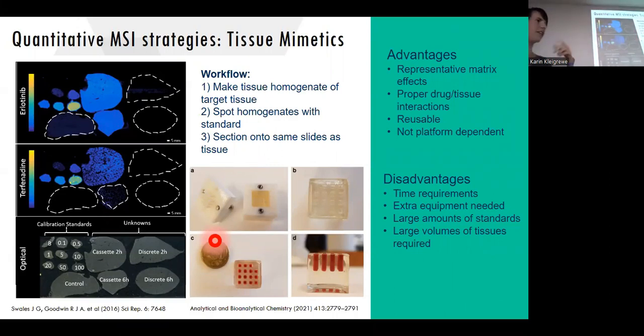And we've had that a lot in AstraZeneca as well, because actually the LCMS teams, they also run so many studies. Like they were 2 people and they were running 300 studies a year. They have no time to optimize. So they've got one method and they run everything over that. And this method actually was not sensitive at all. We were much more sensitive with the MSI. But yeah, we had less throughput. We had more time to work on things as well.